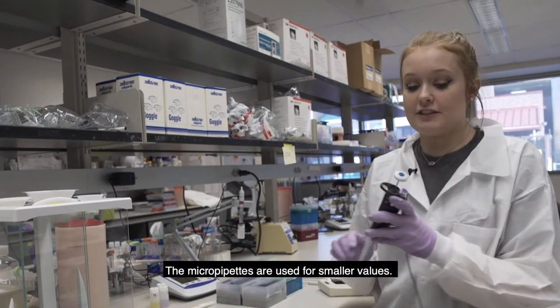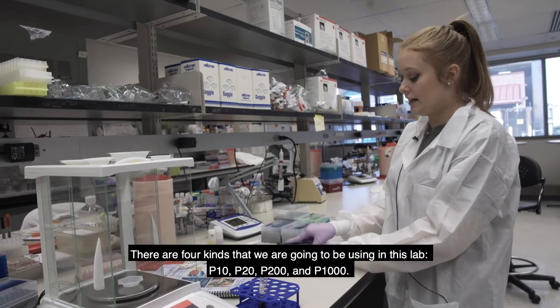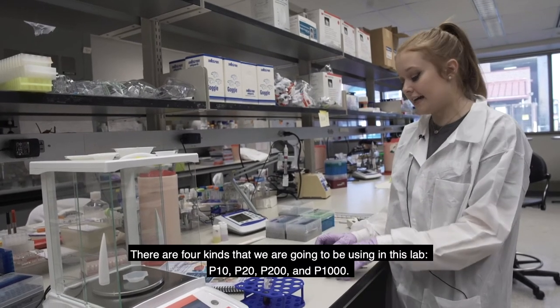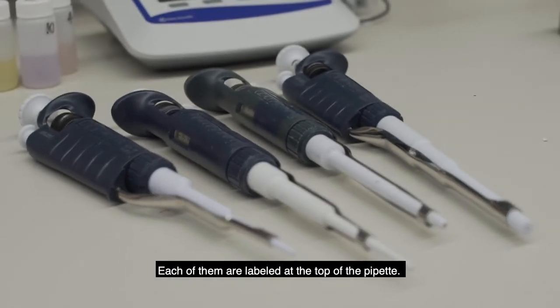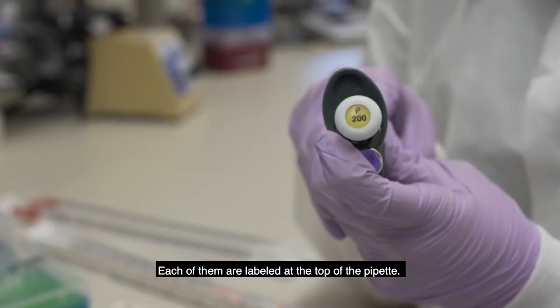The micropipettes are used for smaller values. So there's four kinds that we're going to be using in this lab, the P10, P20, P200, and P1000. And each of them are labeled at the top of the pipette.